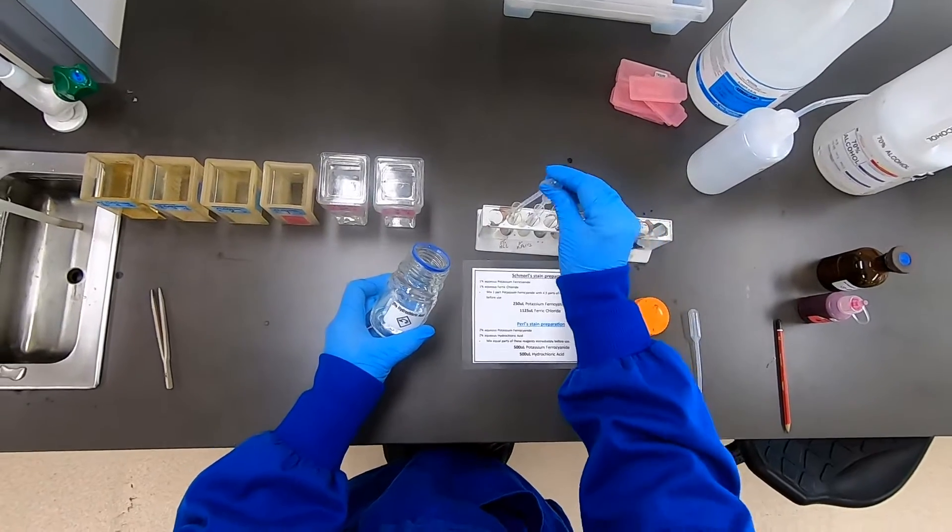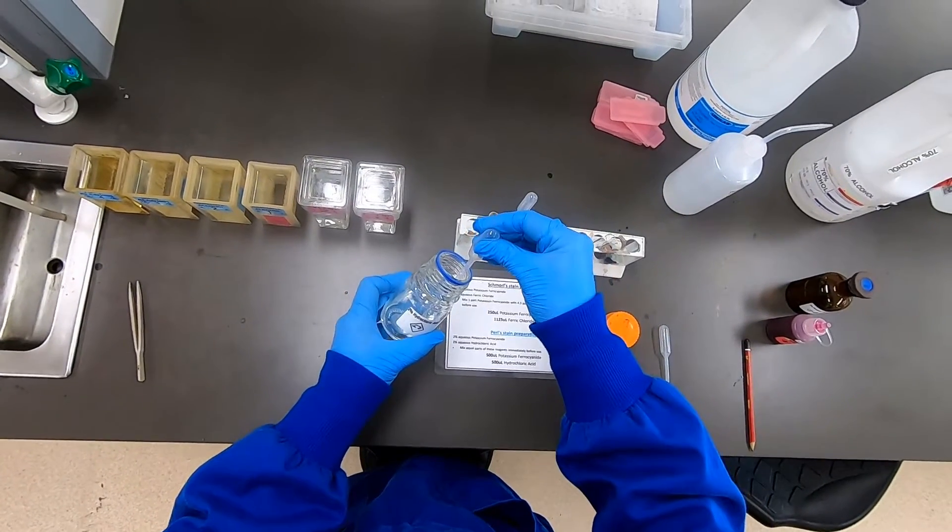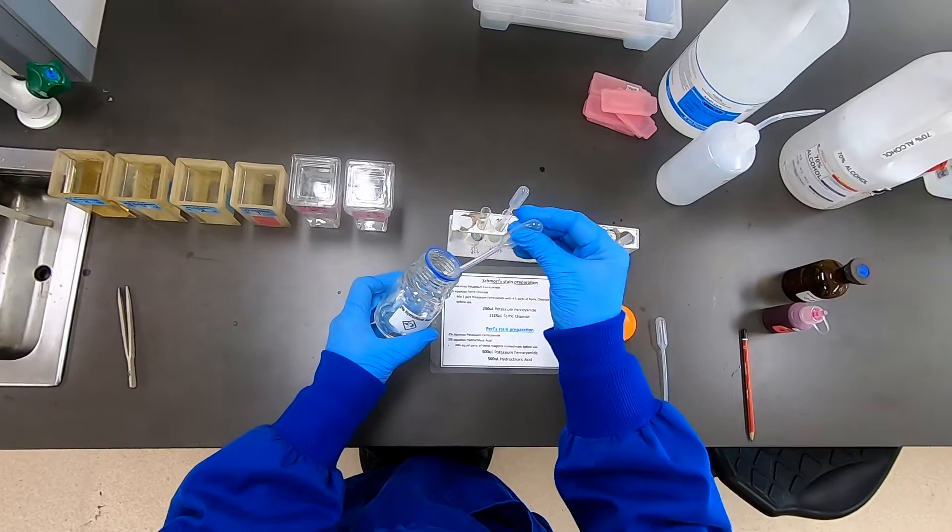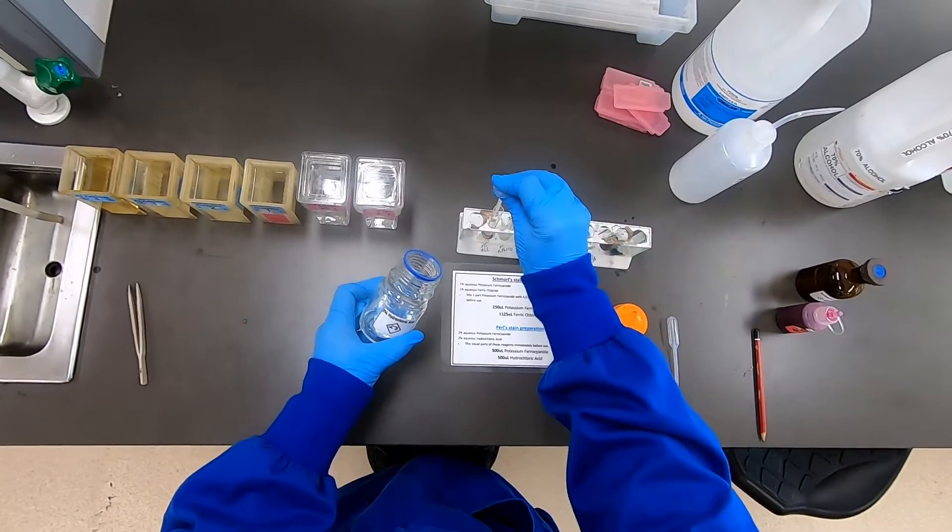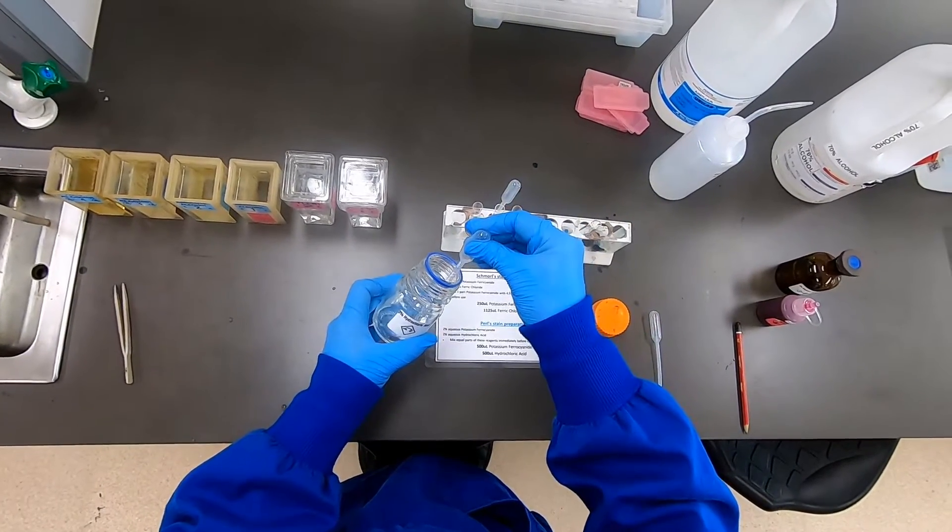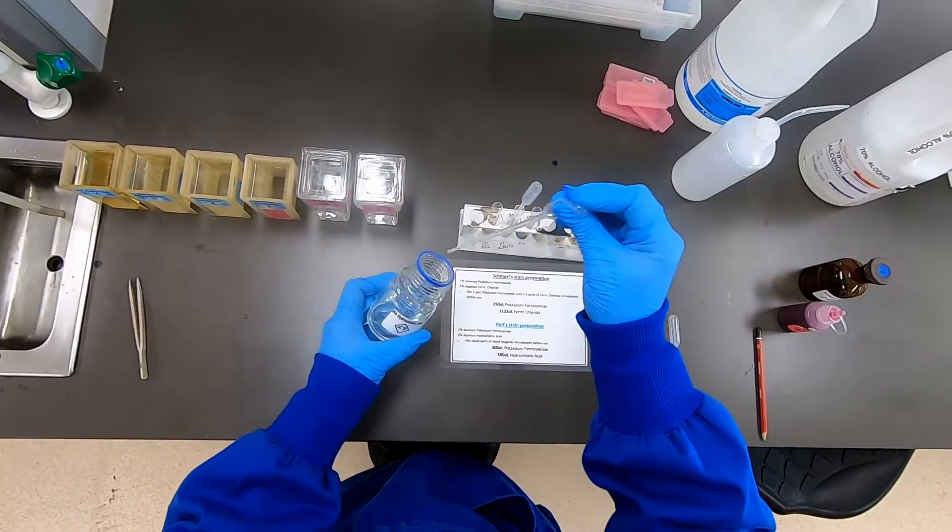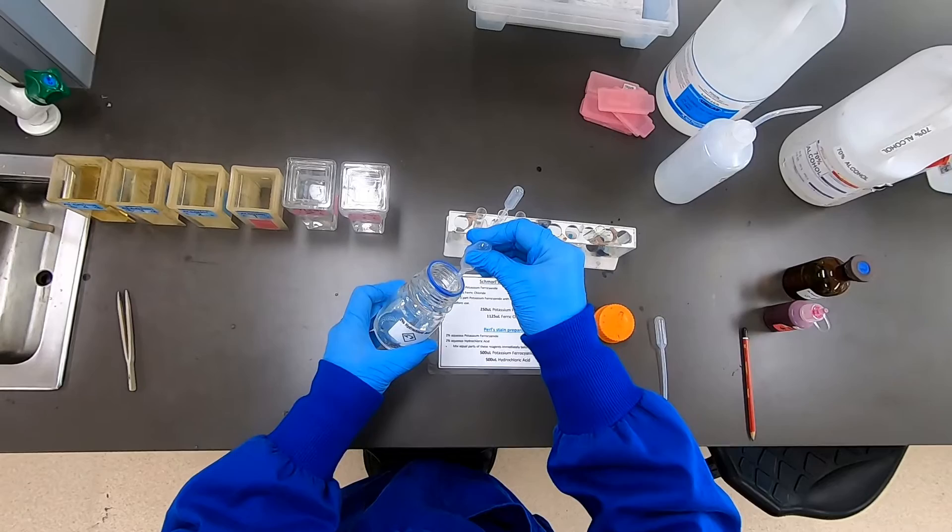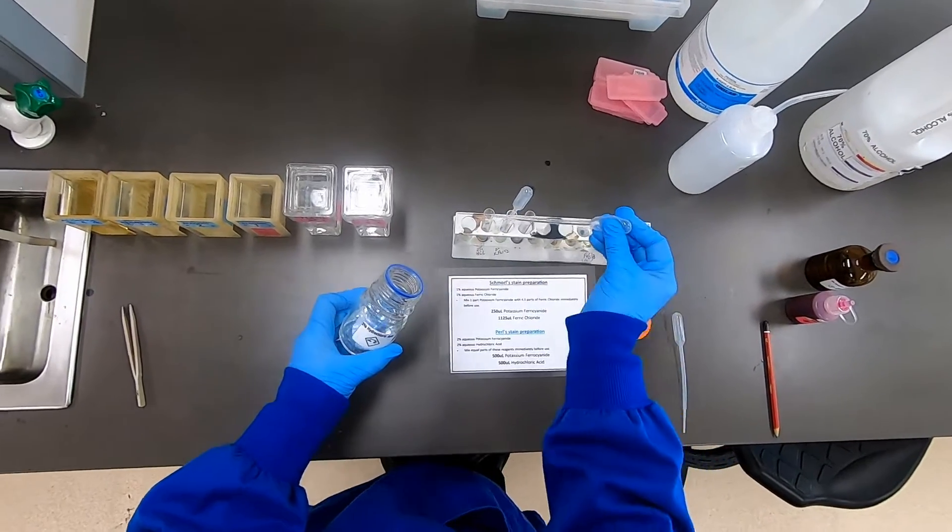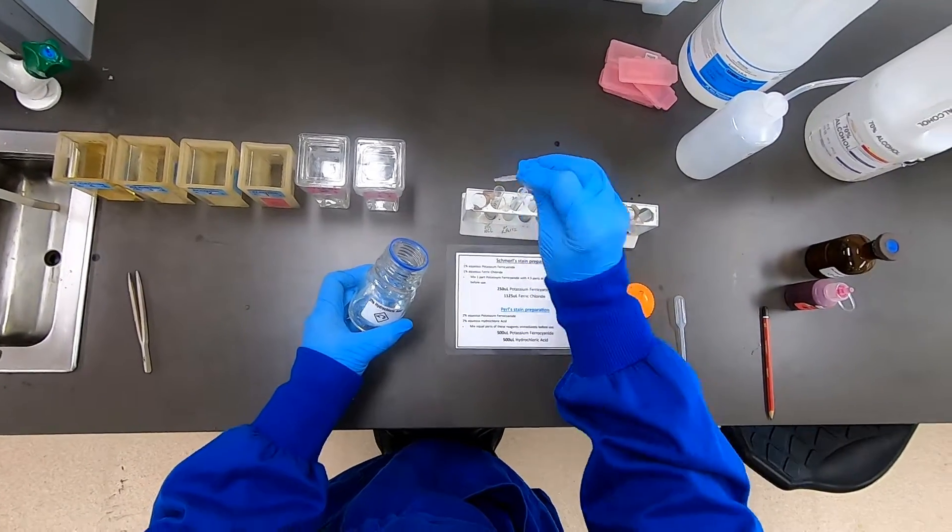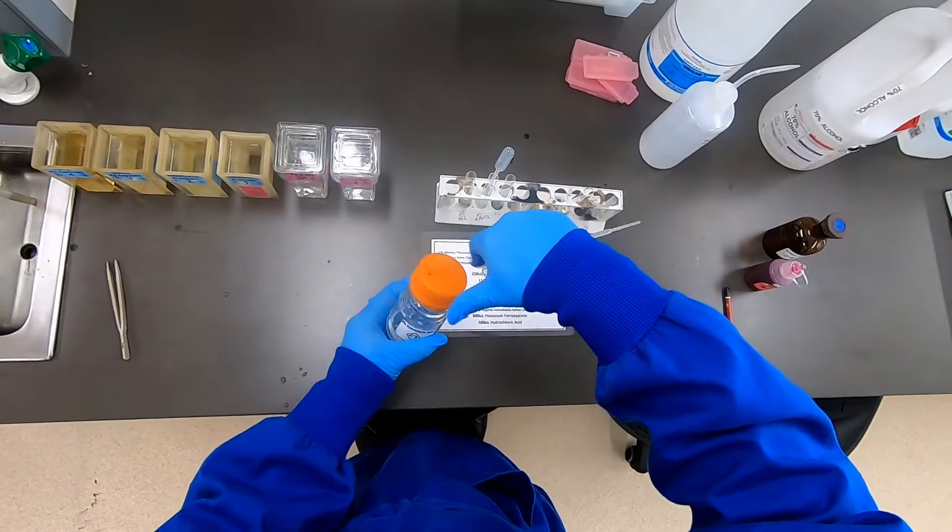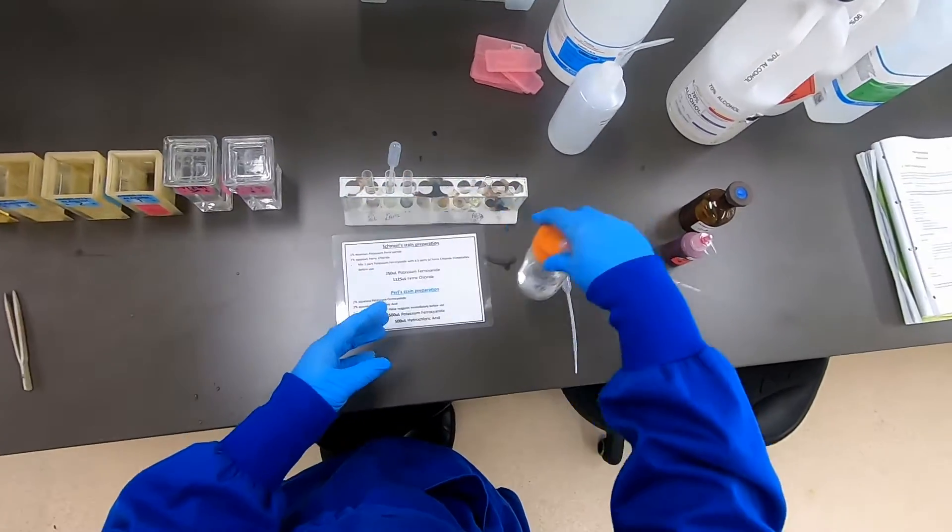On this occasion I have around 8 slides to be stained, so we'll measure out approximately 4 mL of the hydrochloric acid, then combine that with an equal volume of the potassium ferrocyanide.